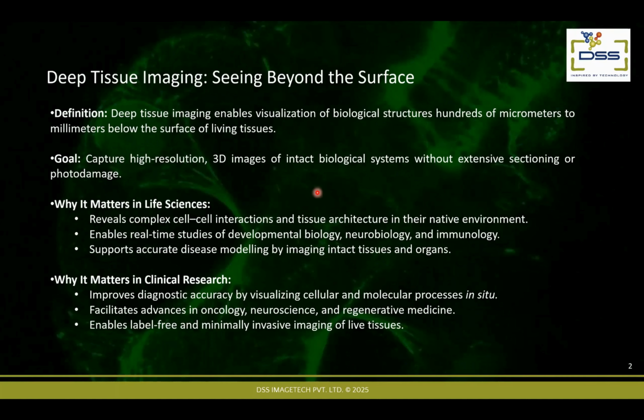And also we can look at, for example, cancer tissue or any patient tissue and stain it with certain antibodies and dyes, and study with deeper imaging what kind of disease or abnormalities there are, and how these diseases and abnormalities can alter the tissue structure.